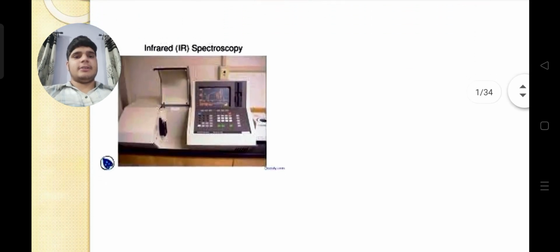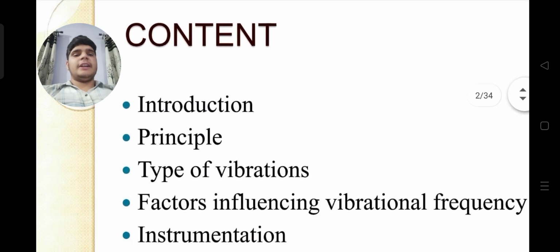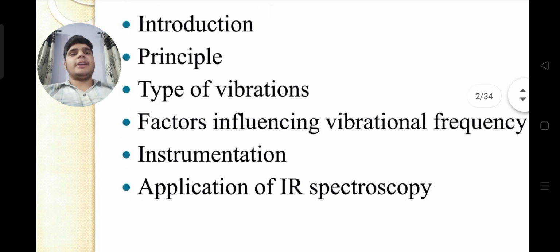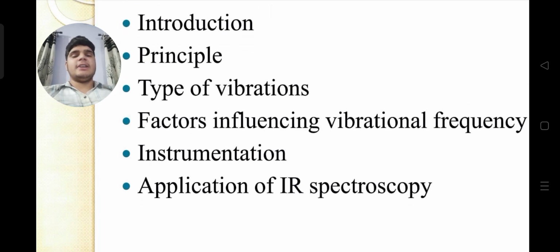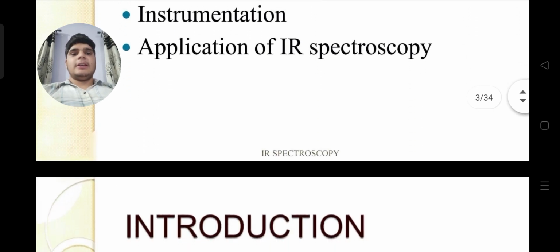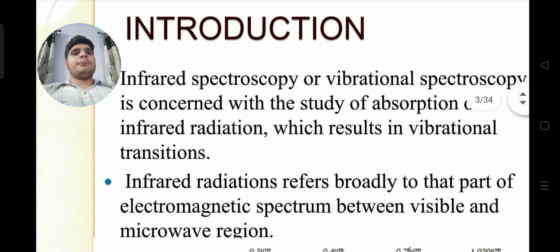Let's start with the content we study in the following presentation. Firstly, we will do some introduction about IR spectroscopy, then we will discuss the principle of IR spectroscopy, then we will discuss the types of vibrations, factors influencing the vibrational frequency, instrumentation, and application of IR spectroscopy in our daily lives. Let's start with the introduction.